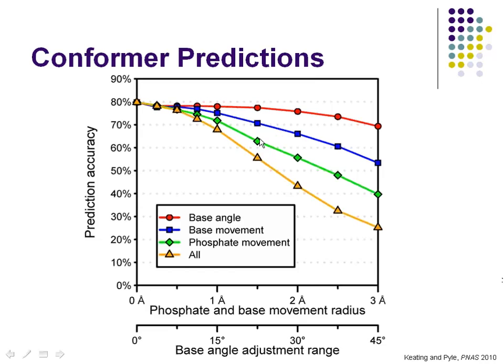With your phosphate coordinates, that does need to be a little bit more accurate, but as I mentioned before, phosphates are very electron dense, so trying to get them within an angstrom or an angstrom and a half of their correct location isn't a horribly daunting task. I should also point out, just to give some sense of scale for this plot, 2 adjacent nucleotides in an A-form helix are about 2.7 angstroms apart. So if you're working over in this area of the plot where you have 3 angstroms of error, you're probably building nucleotides past where the next nucleotide should be, and this really isn't an atomically interpretable map.